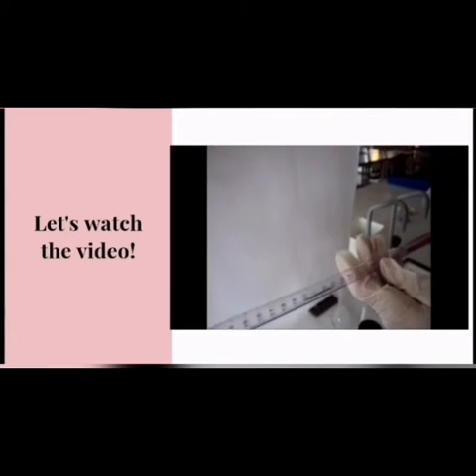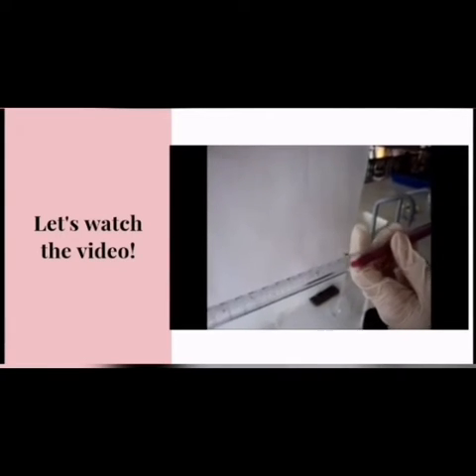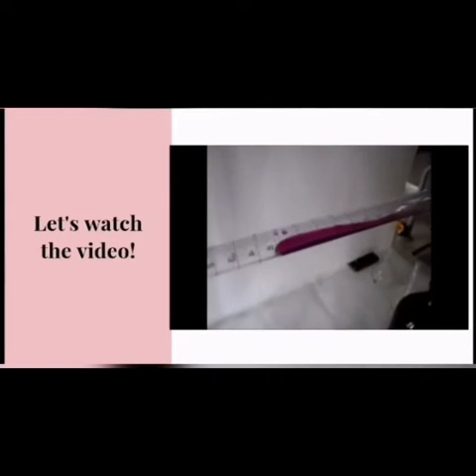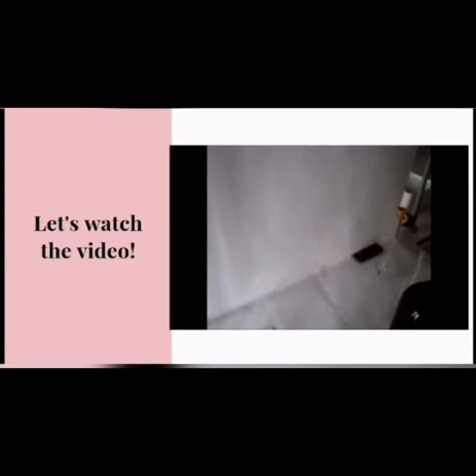Next, for the titration experiment, first the burette was rinsed with distilled water and then with potassium permanganate solution. Make sure when you fill it in, the top of the burette is below eye level.